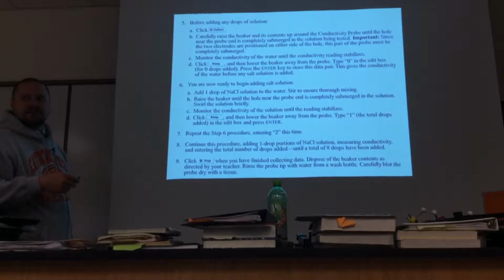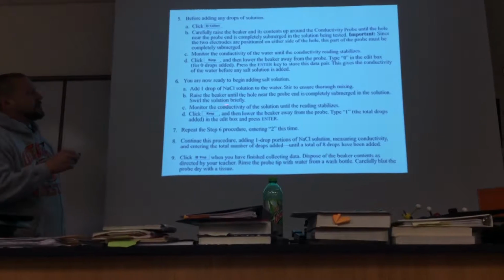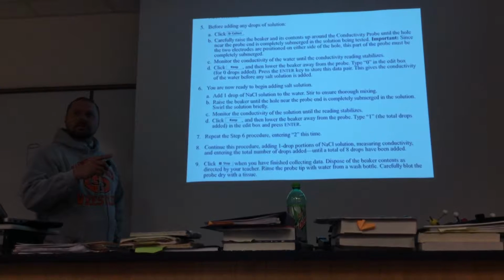A drop is not just a random number. It's actually an actual quantity. But you're going to add 1 drop, and you're going to stir it up pretty good. Then you're going to put the beaker back up into the probe. You're going to wait till it stabilizes, and you hit keep again. And you're going to type in 1, meaning you added a total of 1 drop.